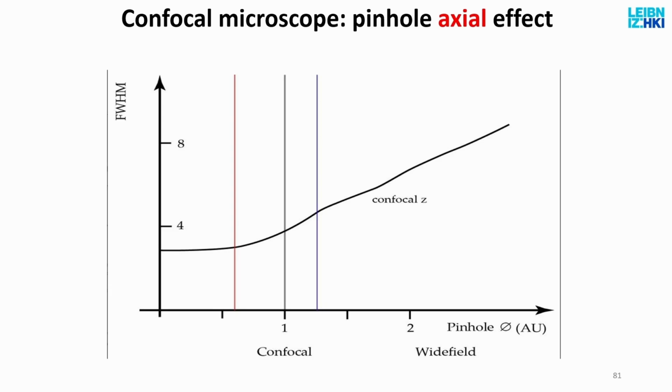The point being is that it's basically a microscope with a pattern illumination, much cheaper. I don't know how much one is these days, but it gives you good enough quality so you can do 3D image analysis without having a confocal microscope, and it's fast. It's a wide-field system, it's a camera-based system, so you don't need to scan. Confocal microscopes are slow. Spinning disk confocal is faster. But point scan confocals are slow, and these guys are much faster, cheaper, gentler. So usually structured illumination microscopy is gentle and fast, and it doesn't need special dyes.